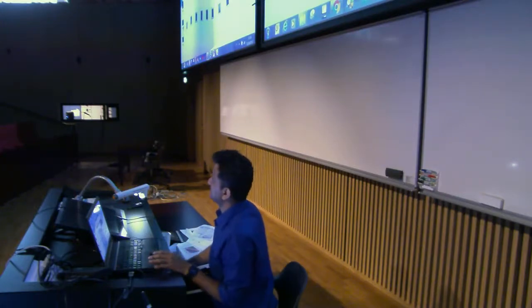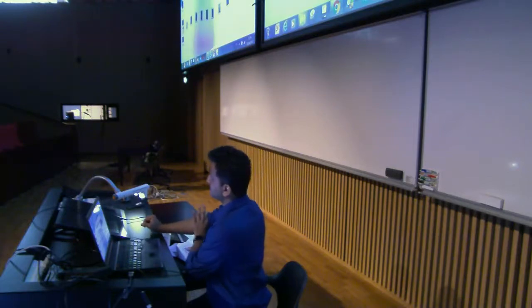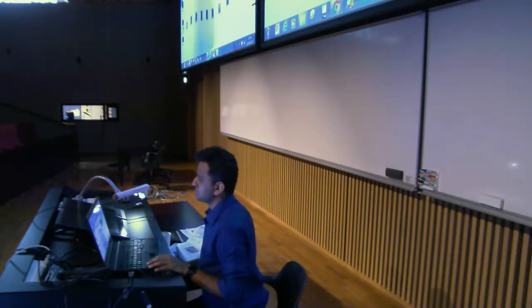Again, there are different settings for that. It's not that straightforward that you just click the button. There are some different algorithms for that. So we will cover all of that in the next workshop.